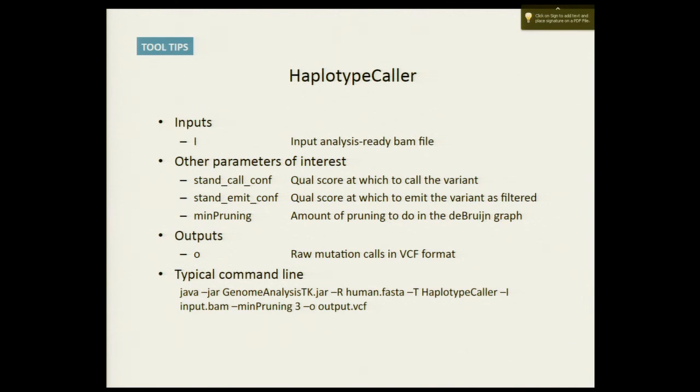What is K? What is your k-mer size? Oh, interesting. I didn't go into those details, but the k-mer size is every possible k-mer from, I think, a minimum of like 10 to the length of the read. So it's actually making many assembly graphs. It's using all possible k-mers. I really can't hear you at all, sorry.